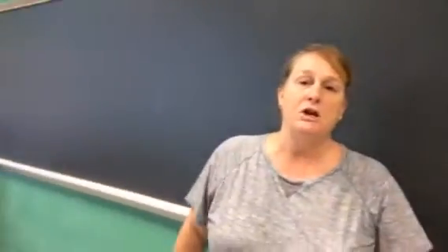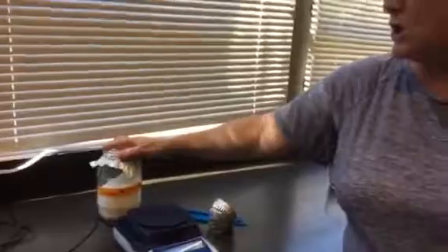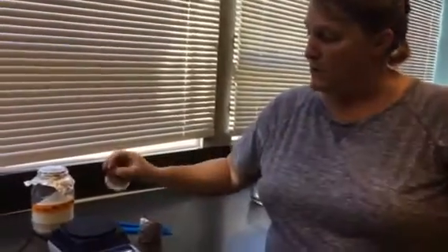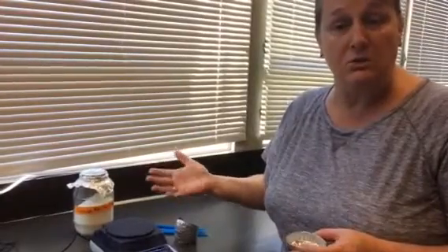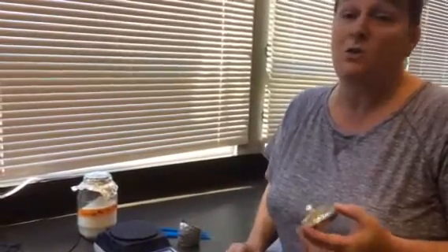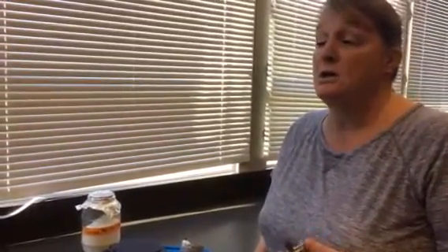Let's go over here and look at where we're going to mix these solutions. You're going to be starting with dry materials this week. So you're going to have to figure out how much of this dry, in this case sucrose, you will need to put into this little weigh boat to actually mix with your liquid to make your solution. Now you don't need to make an entire liter, so you're going to have to calculate with milliliters, and your instructors will each individually help you learn how to do that.